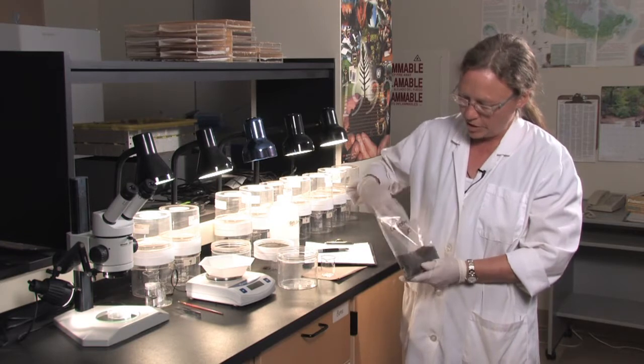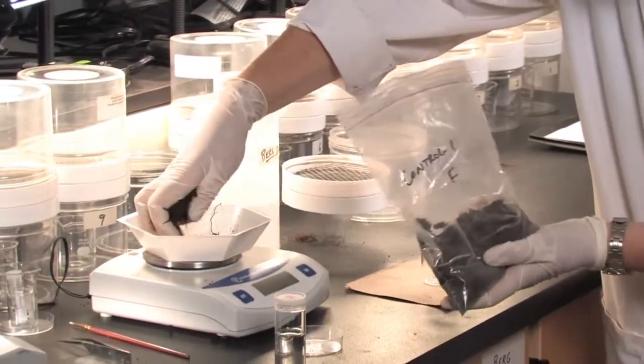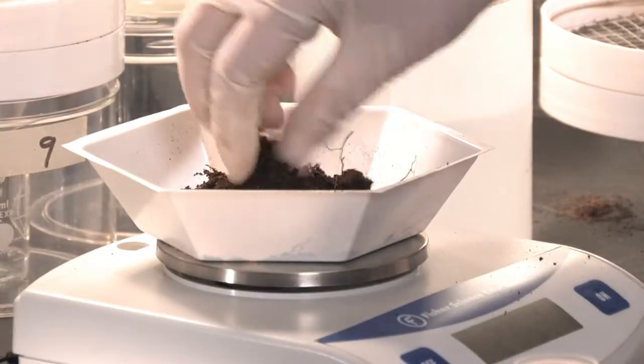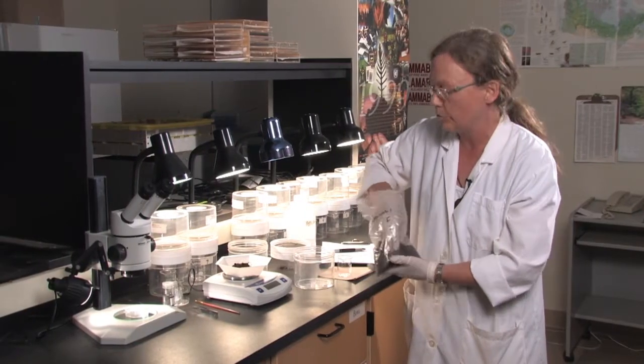First off, we need to measure out 30 to 70 grams of the soil that was received. Sometimes the soil is loose like this and sometimes it is in cores. If it's in cores, you will cut it in 3 centimeter chunks and run it that way.